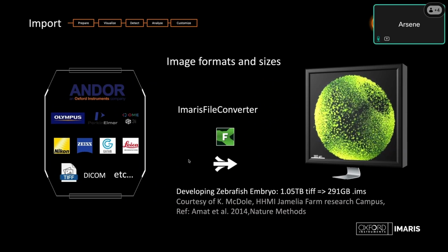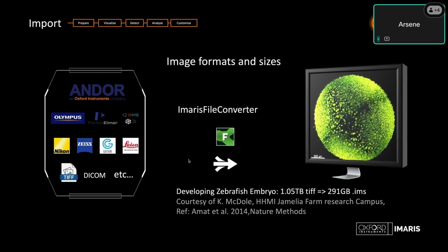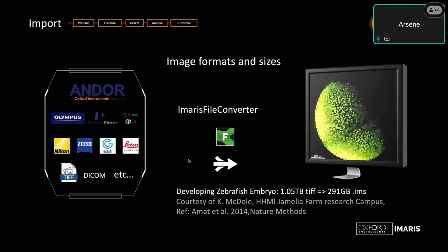And in this slide, I'm showing the reconstruction of a developing zebrafish embryo image of 1 terabyte. So there is basically no limitation of the file size you can open and visualize in IMARIS with your computer.